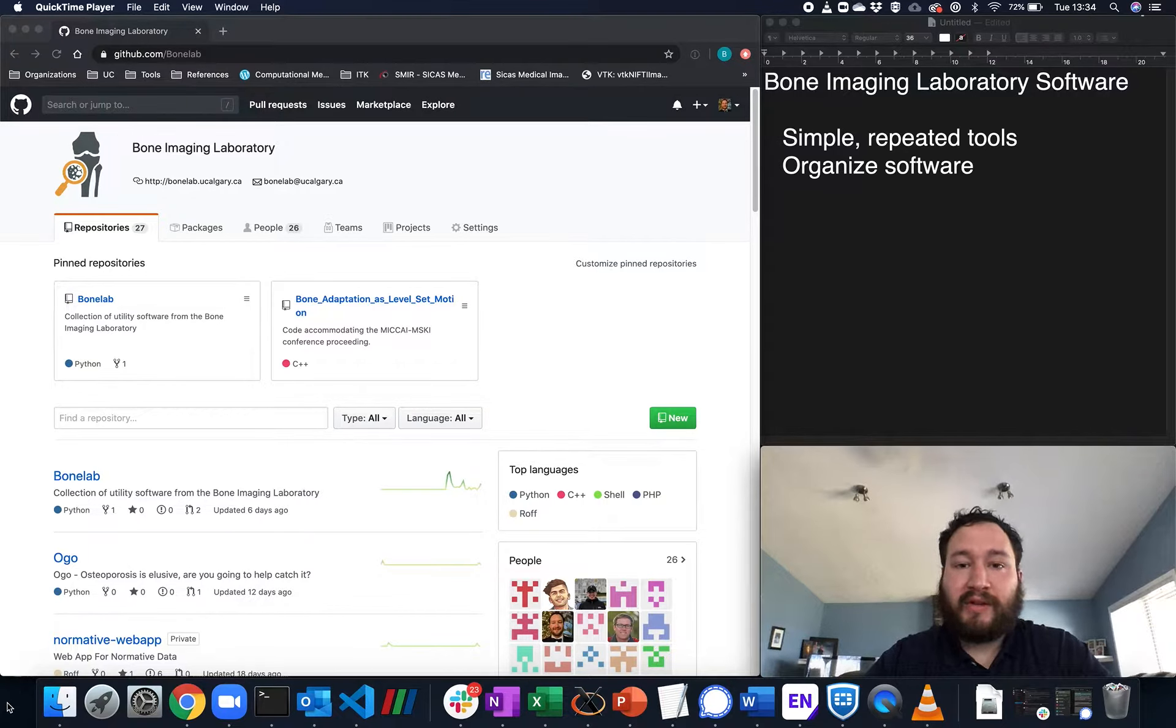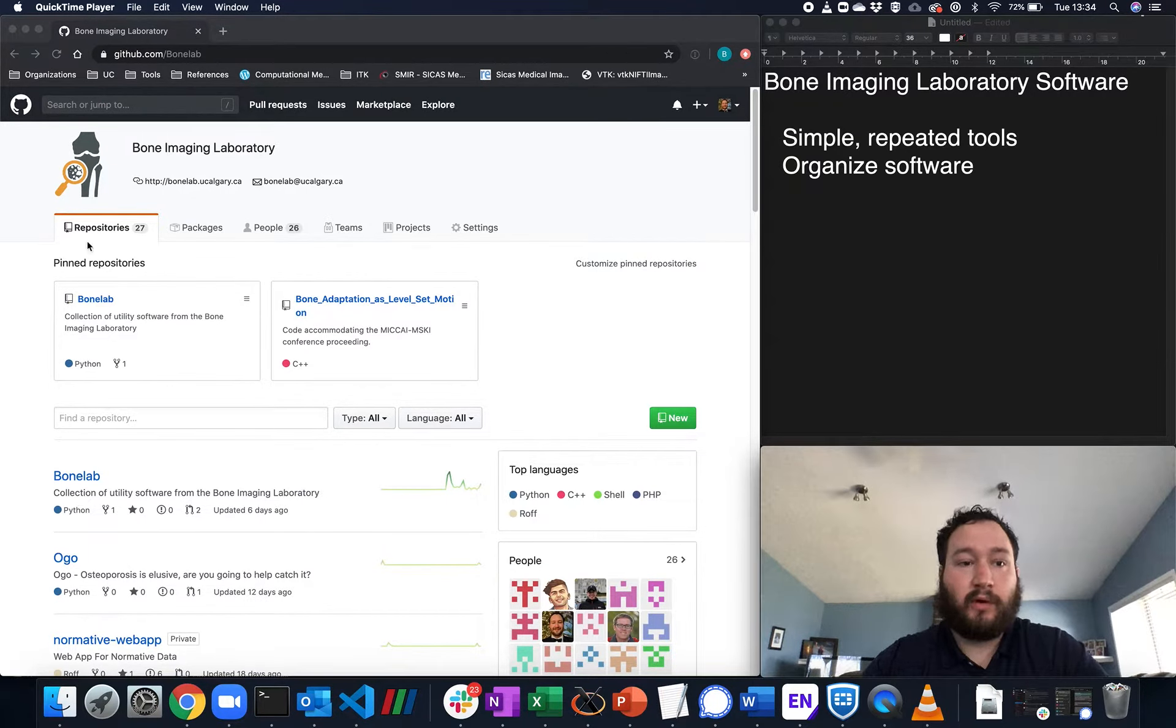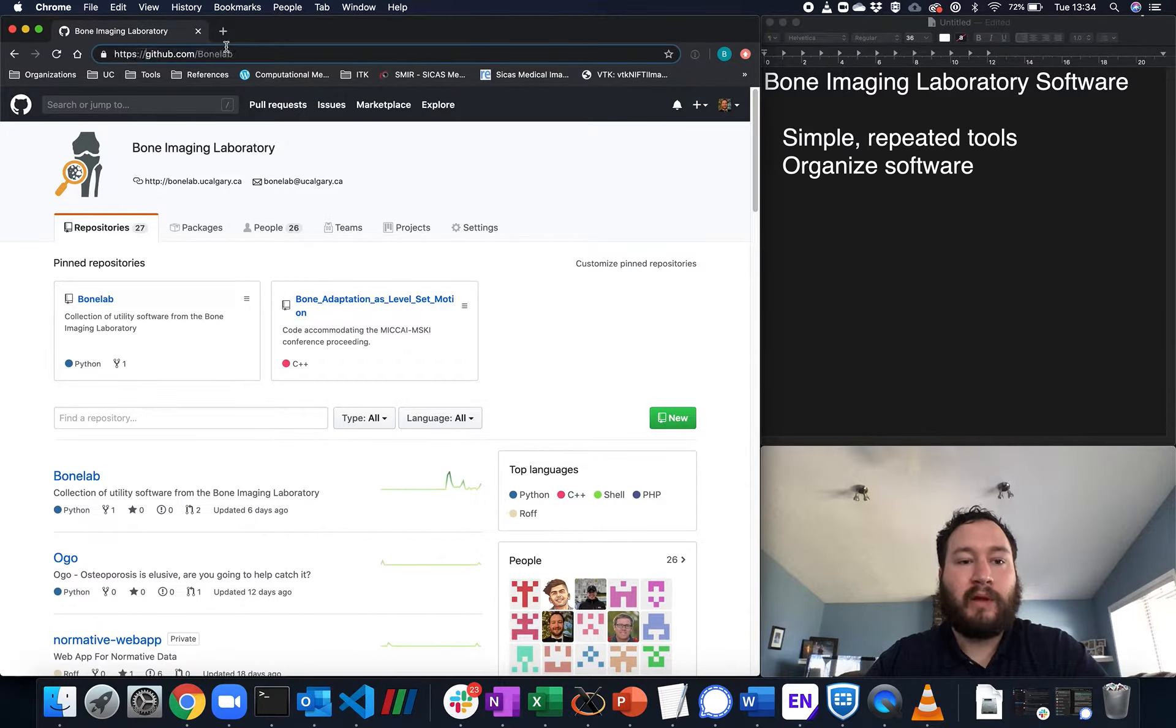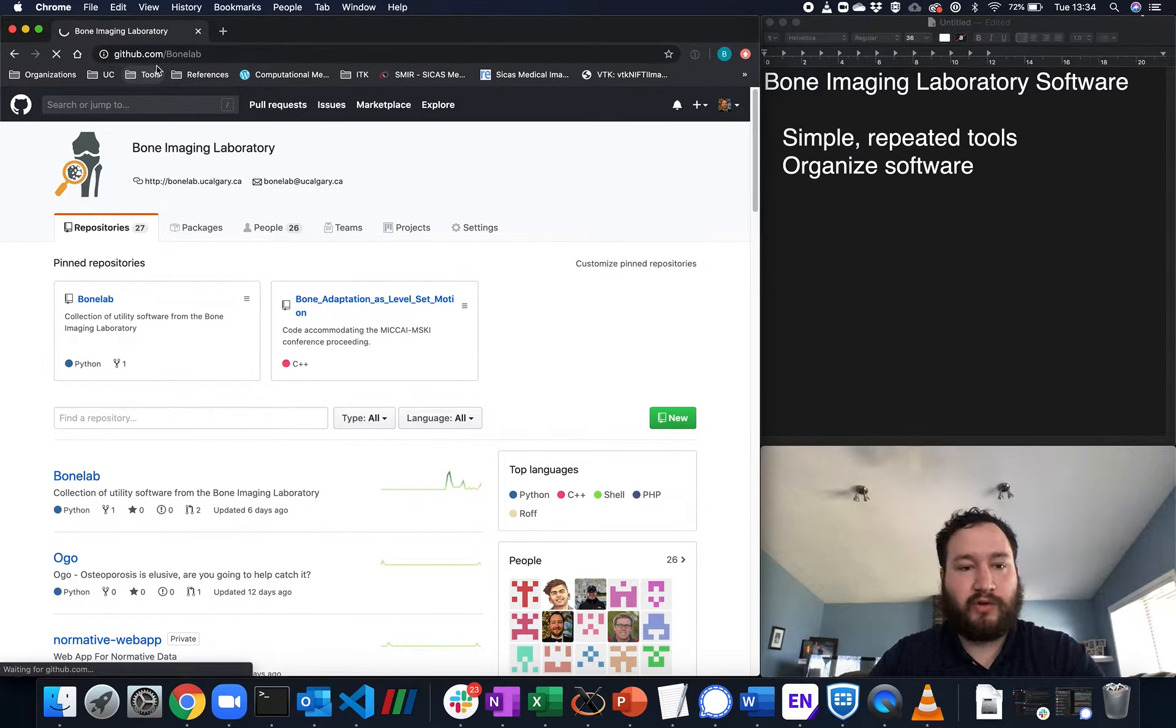Here I would just like to introduce you to the Bone Imaging Laboratory GitHub page. So if you go to github.com slash bone lab, it will bring you to this page.